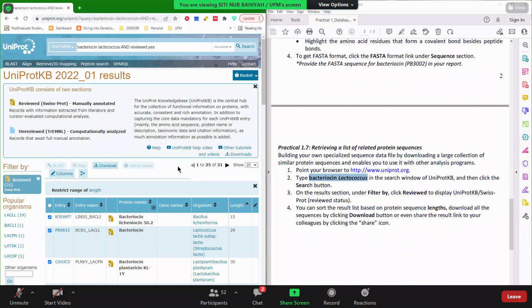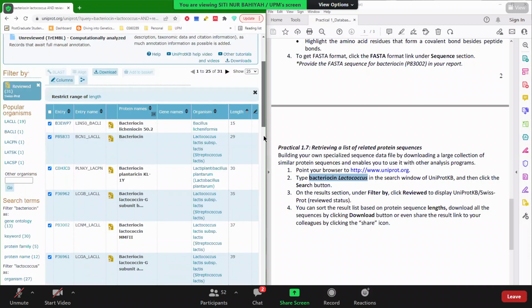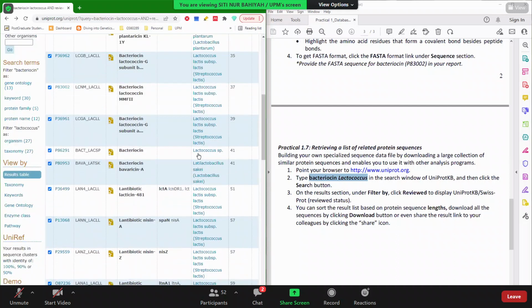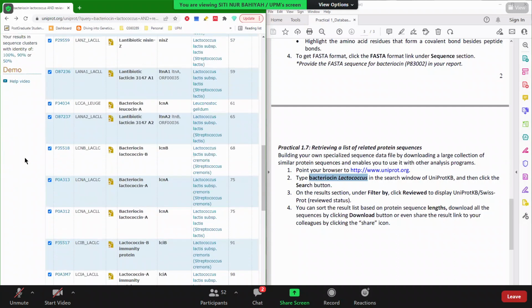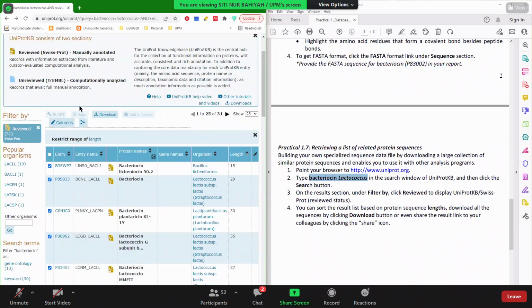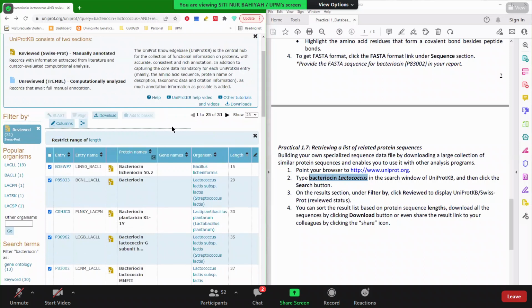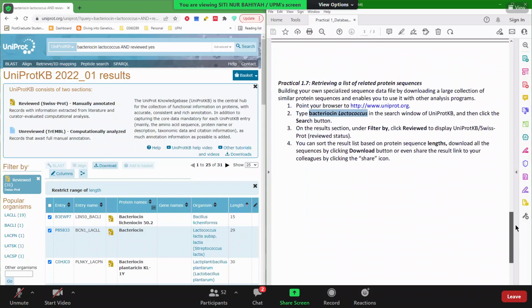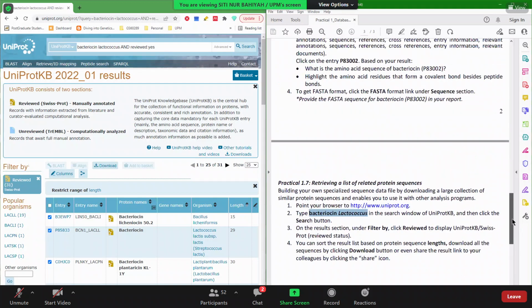So that's basically how you can navigate around UniProt and use all sorts of options out there. Just move around, click around. The buttons are free to use. And it's fun to see that there's a free and available database out there for you guys to use. Along the way in this bioinformatics practical, you guys will be using a lot of BLAST and then GenBank, accession numbers. You guys will see UniProt again also, so this is quite good information on how to start bioinformatics.